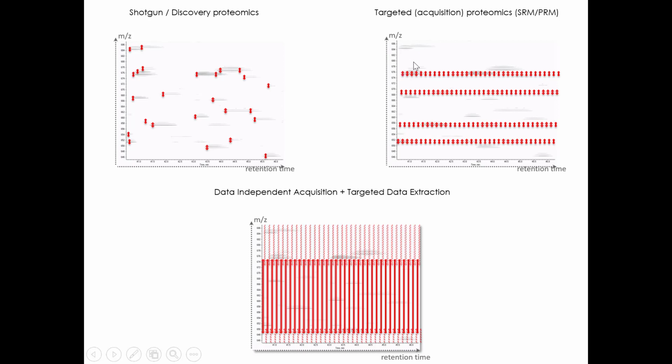And we search for that peptide to quantify it in a sample, and we can do this for a number of peptides concurrently. The peptide will definitely be detected and quantified if it is in a sample, because the mass spectrometer is instructed to always look for this peptide throughout the whole duration of the mass spec experiment. Incidentally, this is the retention time axis of the peptide separation, and this is the precursor mass axis that the mass spectrometer detects.